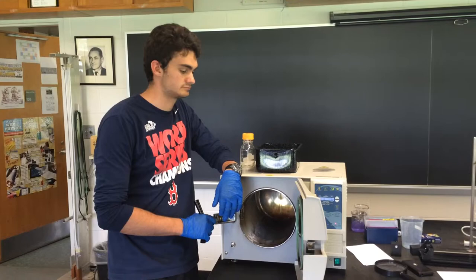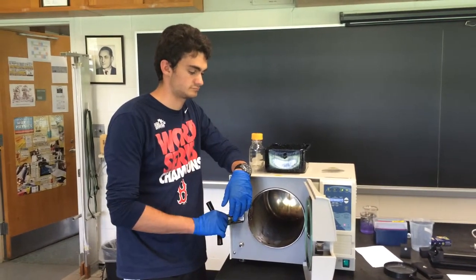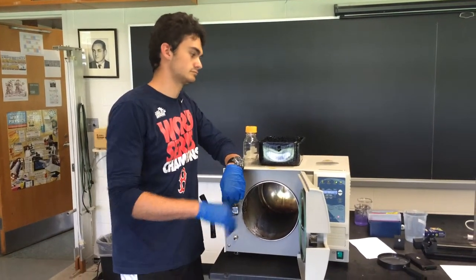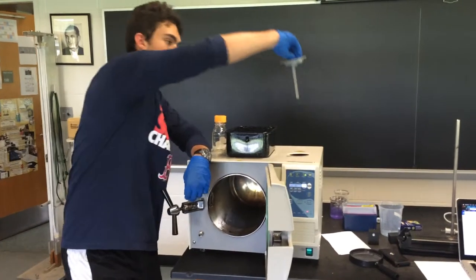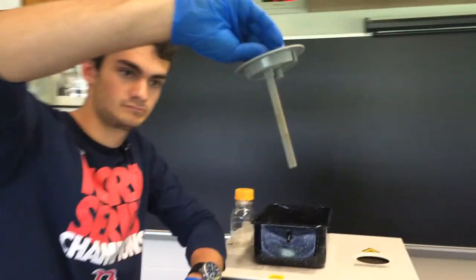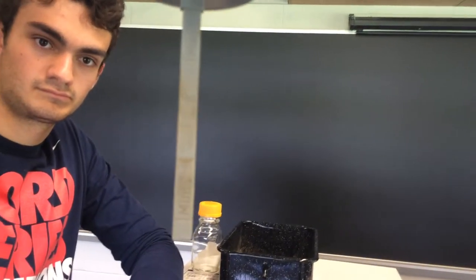There are three key things you want to remember before you even start to use the autoclave. One, make sure there's enough water in the autoclave. There's a maximum and minimum line you can see there, and you just want to make sure that the water line is between those two.